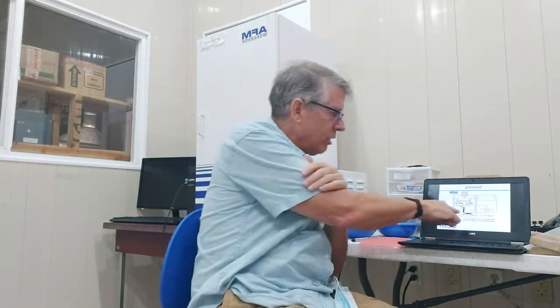Okay? If you don't want to hit the surface, if you don't want to hit those high mountains, you can slow down. So in the microscope, you can slow down the scan rate, and you go over big features, okay? And you won't break the probe. Okay? Do you understand? Yes. Okay.